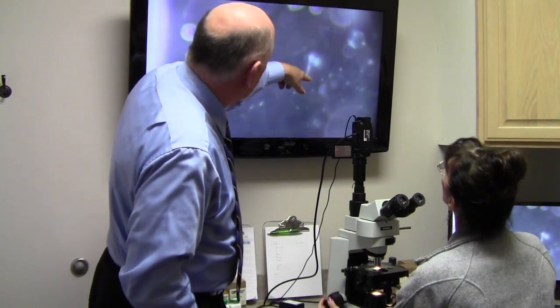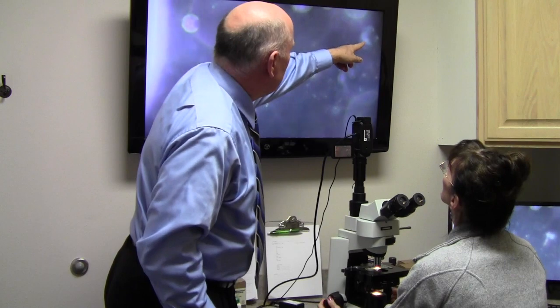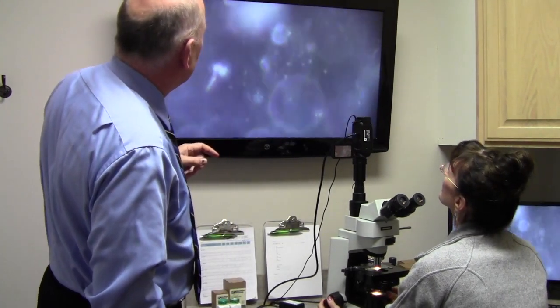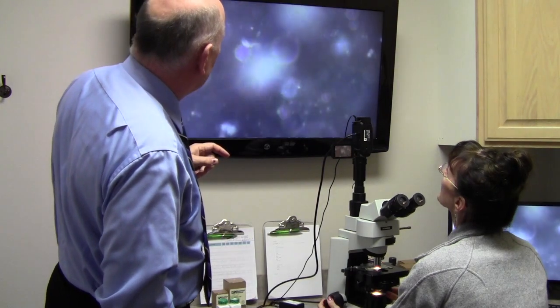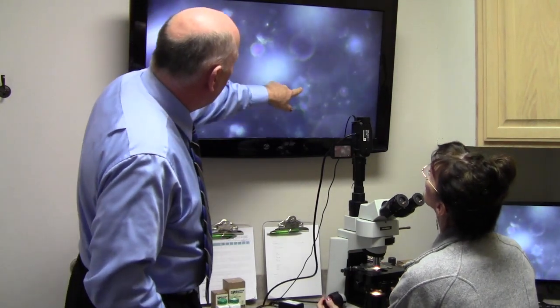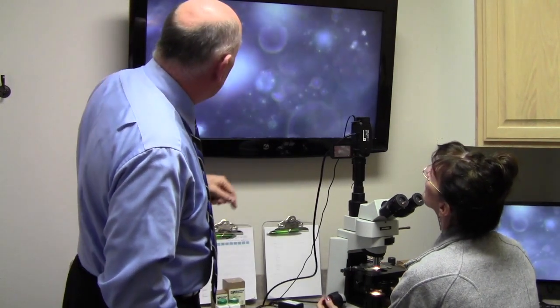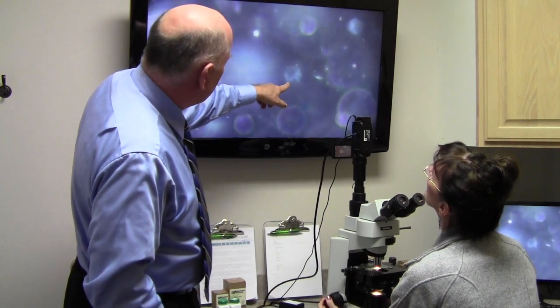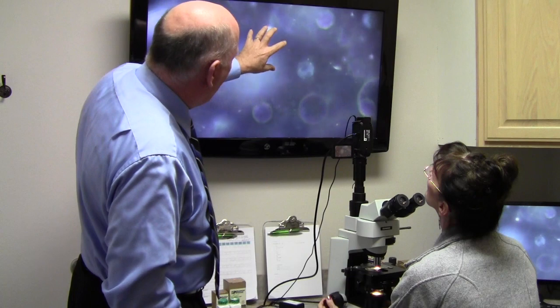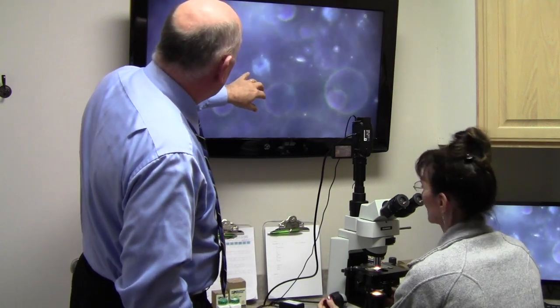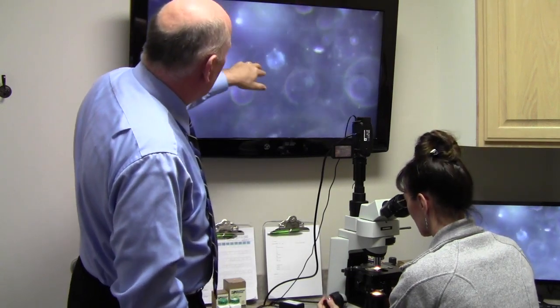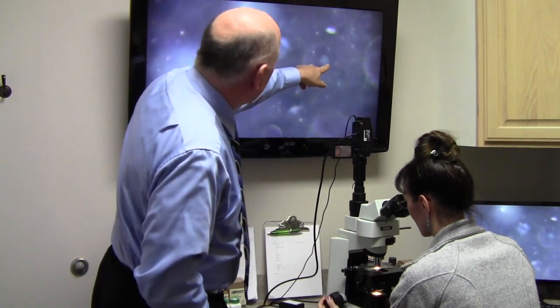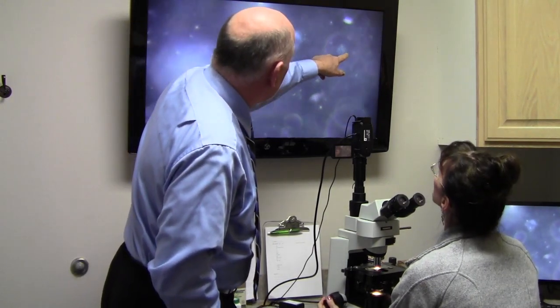There's a biofilm. Okay, there's a biofilm. Go look at that real quick here. Slide over if you can kind of follow that. Notice how the whole thing seems alive. See if you can focus in on that one. Notice how it's, the whole thing is, it's like a round ball, and it's alive. There's a gazillion, lots of little things, there's another one right there. Is that another one? Mm-hmm, it's another biofilm.